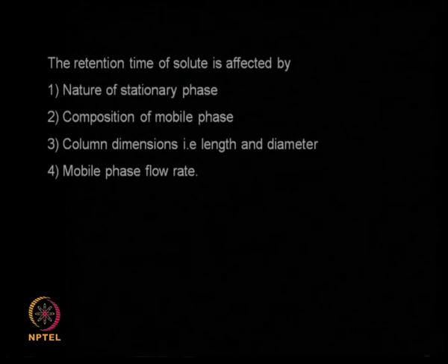So the retention time of a solute is affected by many parameters: the nature of the stationary phase, that means what type of stationary phase I am using, the porosity, the particle size distribution, whether it is charged, uncharged, whether it has hydrophobic groups, and so on. Then the composition of the mobile phase, which is a solvent: does it have water, pure solvent, mixtures of solvent, what is the polarity of the solvent mixture, the dipole moment, the viscosity of the solvent mixture, and so on.